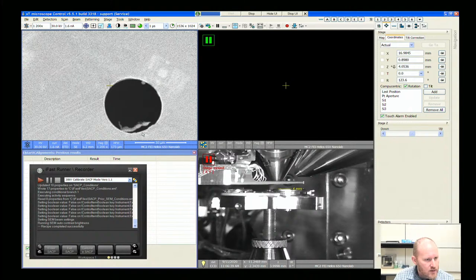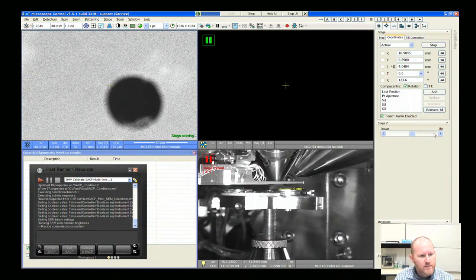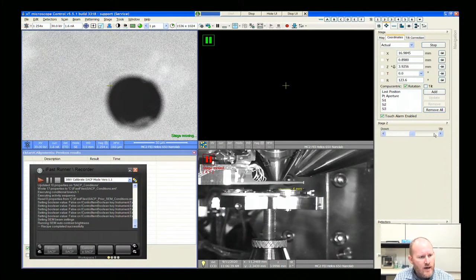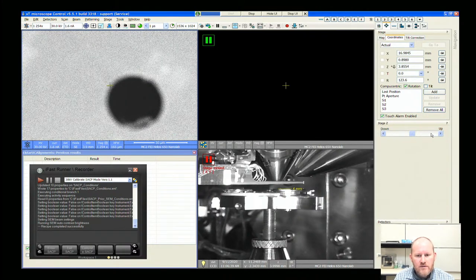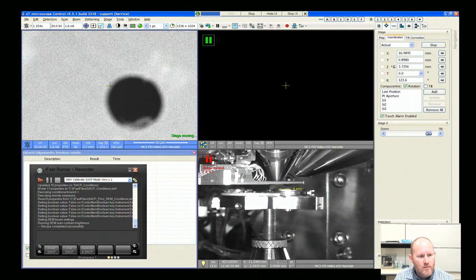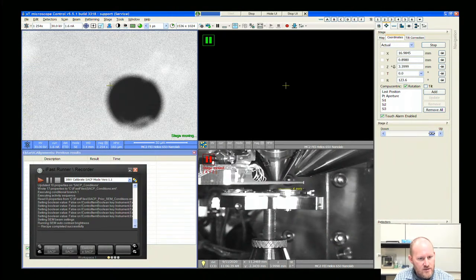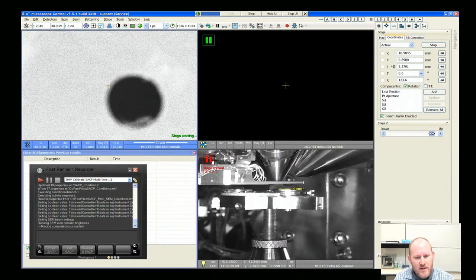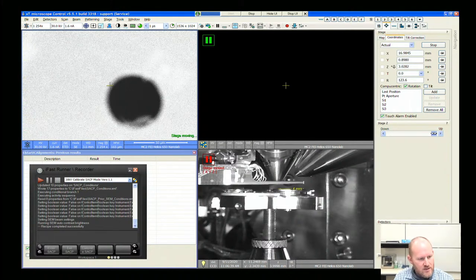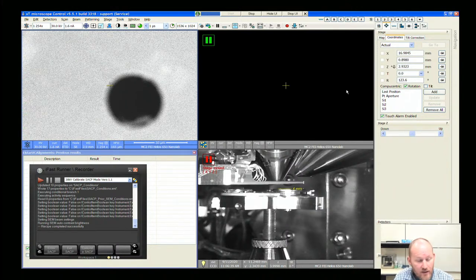It appears that we're at 6.4 millimeter — I need to bring the stage up to get that in focus at four millimeters. We've chosen four millimeter kind of arbitrarily, just because that's where we're going to get the best backscatter signal. Anyone with a Helios will know that four millimeter is just the eucentric point. For SACP there's no reason you need to be at 30 kV; there's no reason you need to be at four millimeter — these are just the beam conditions we've found.